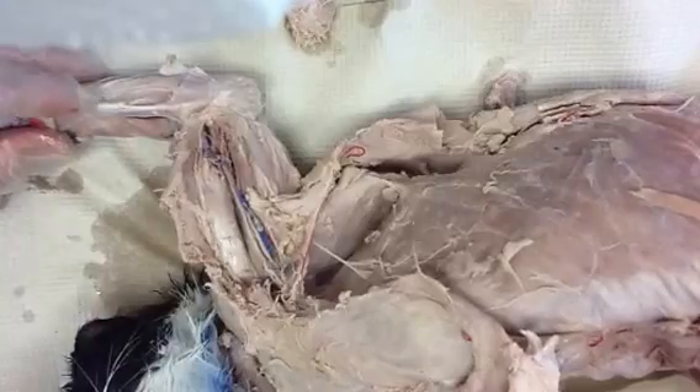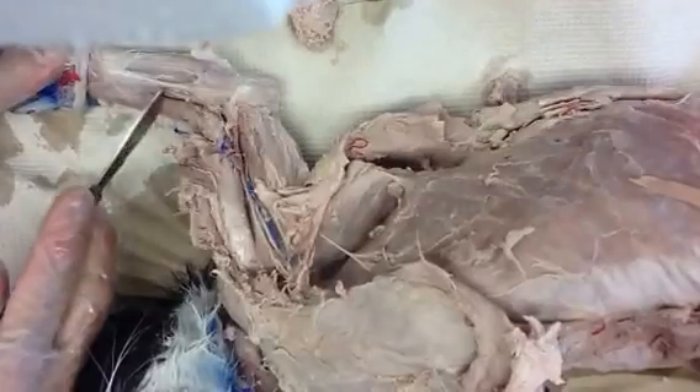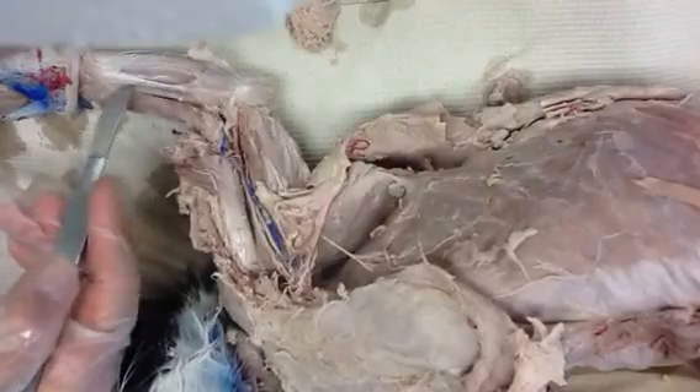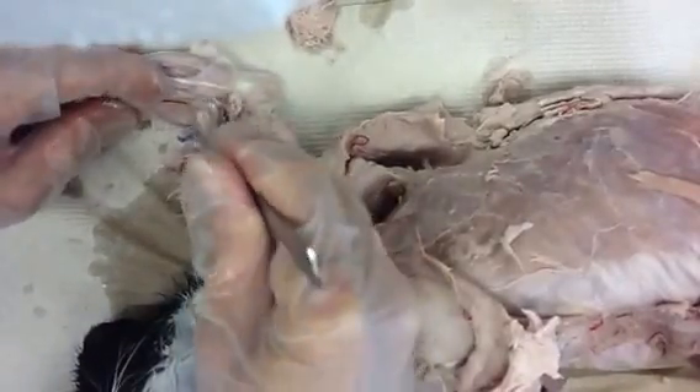So now we're just going to cut into that lower antebrachium and see if we can figure out where those nerves are going. Here is a tendon right here — these are some of the antebrachium flexors. They only have about five minutes and they need to go, and this is the only time we have the cat out.